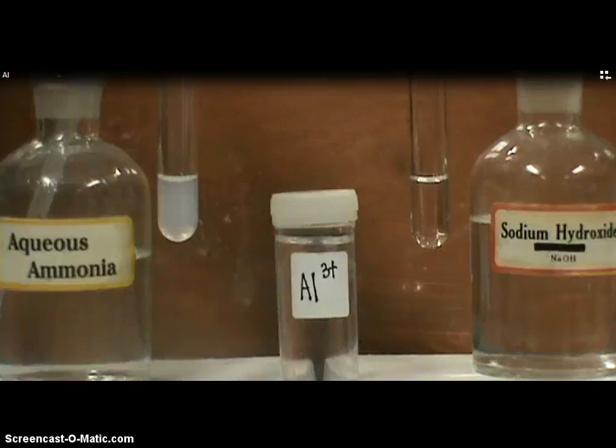Notice that both lead-2 ion and aluminum ion gave similar observations to the cation test. How then can we distinguish these 2 ions? Do discuss this with your respective chem teachers to find out more.